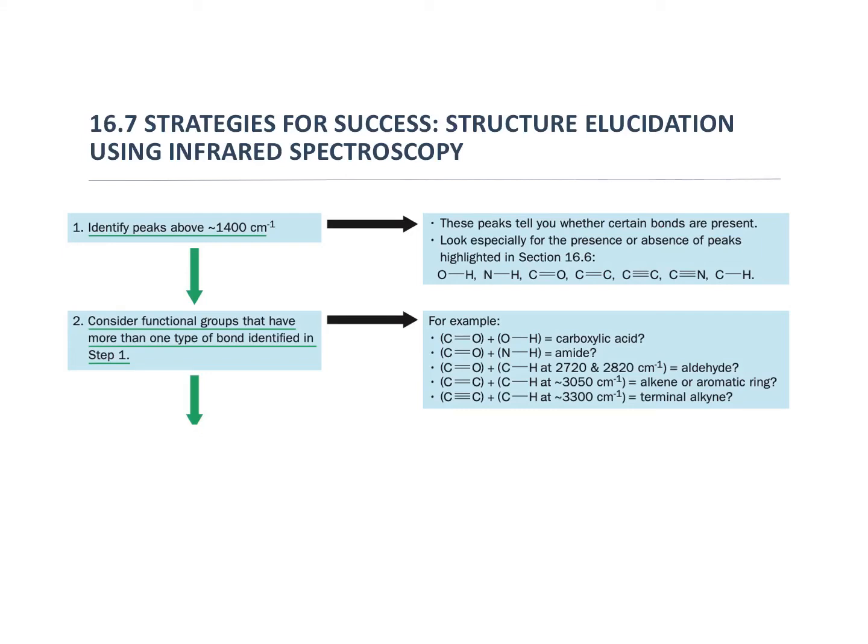So one of the things we want to do right now is practice identifying some unknown compounds. Again, we are not going to get the certain identity of any of these compounds when we're done. We have to use IR in conjunction with another spectroscopy technique. It's good to approach these in a systematic fashion.